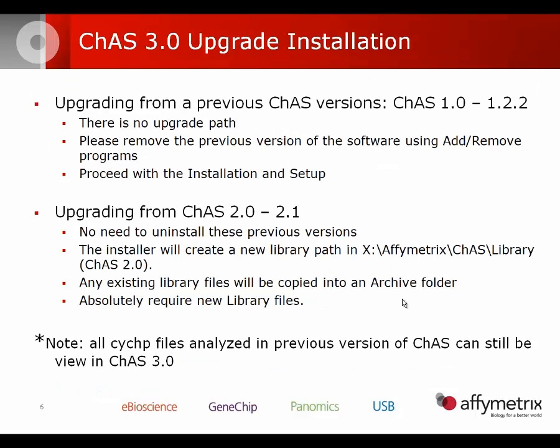When upgrading from previous versions: if you have CHAS 1.0, 1.1, or 1.2 through 1.2.2, there is no upgrade path — please remove all previous versions using Add/Remove Programs before proceeding. Upgrading from CHAS 2.0 or 2.1 is supported; you do not need to uninstall it through Add/Remove Programs. Simply run the CHAS 3.0 installer.